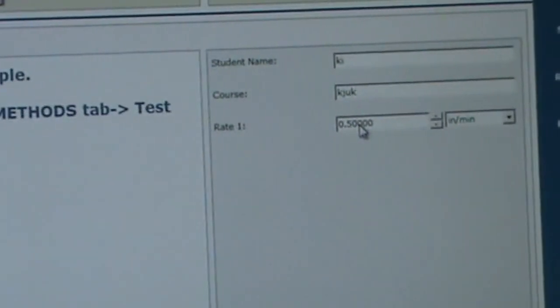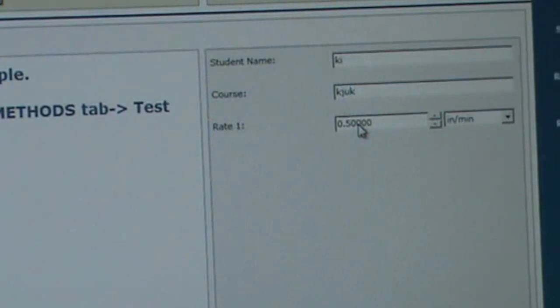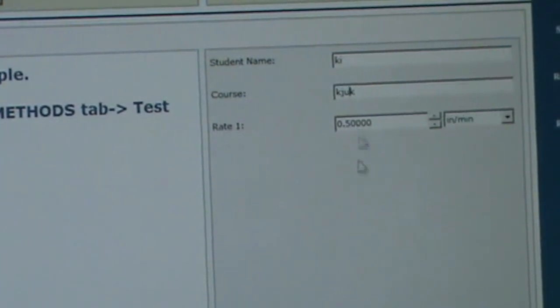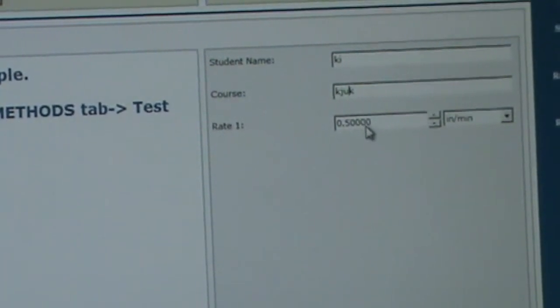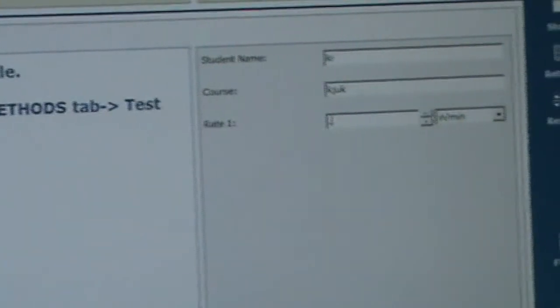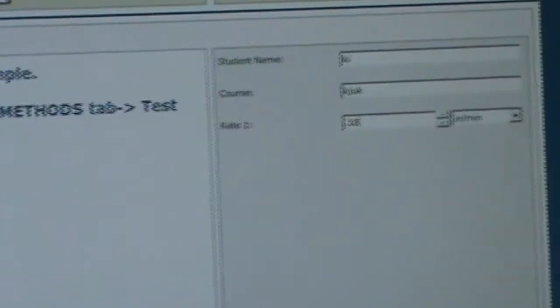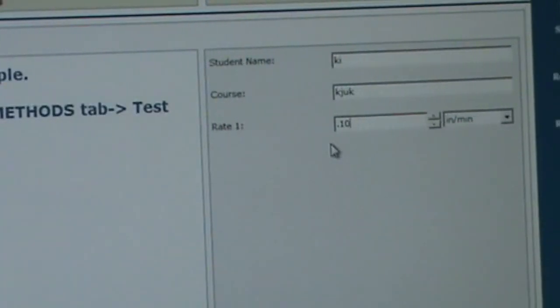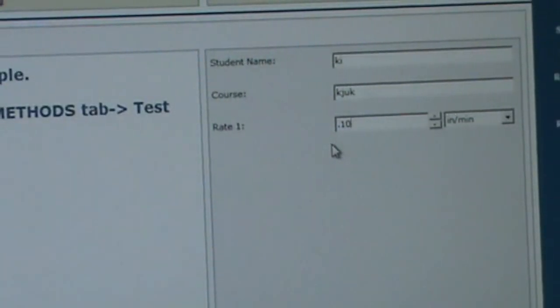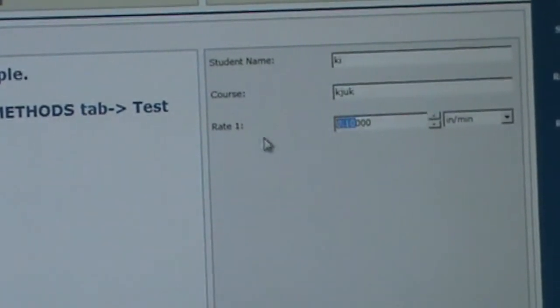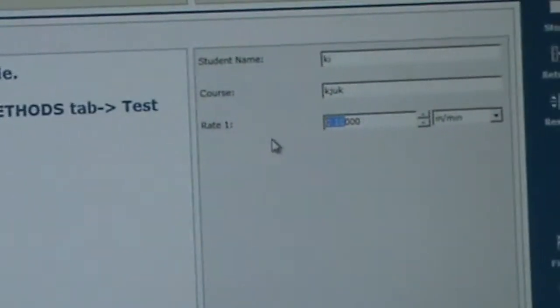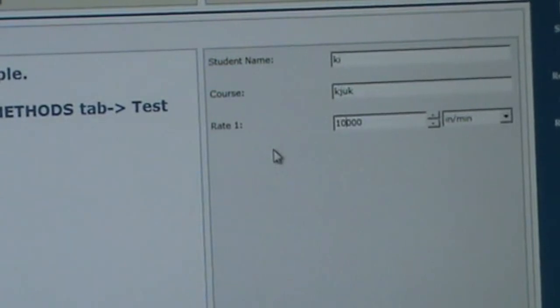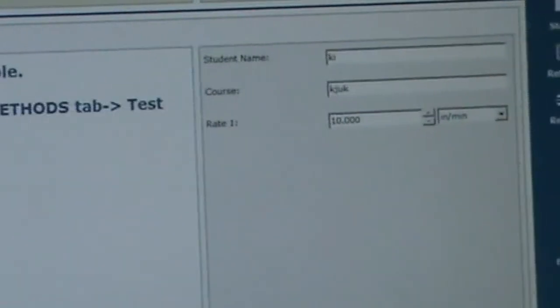So in the first test, you're going to break all your samples, one of each group, at 10 inches a minute. So we're going to change this to 10. That's 10 inches, 10 inches a minute.